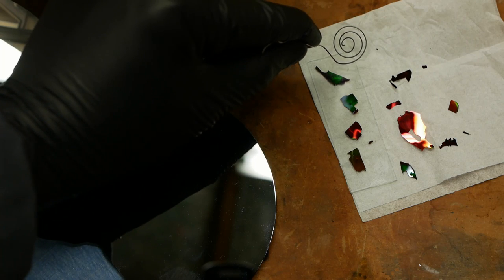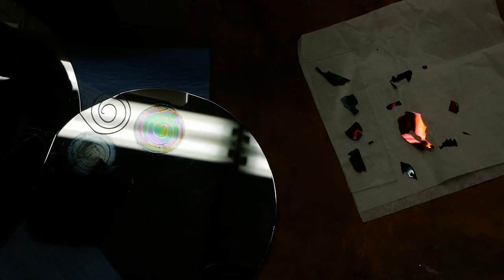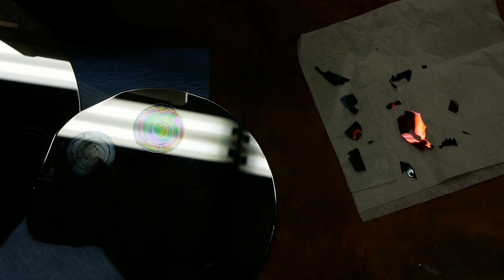This is an N-type wafer that I etched with a ultraviolet light shining down onto it. And the electrode that I was using at the time was this curly piece of wire that I was holding right over the top of the wafer. And if we look at the reflection, you can actually see the shadow of this wire is etched into the surface. So only the parts that were getting ultraviolet light shined on it were etching and the shadowed areas were left alone.